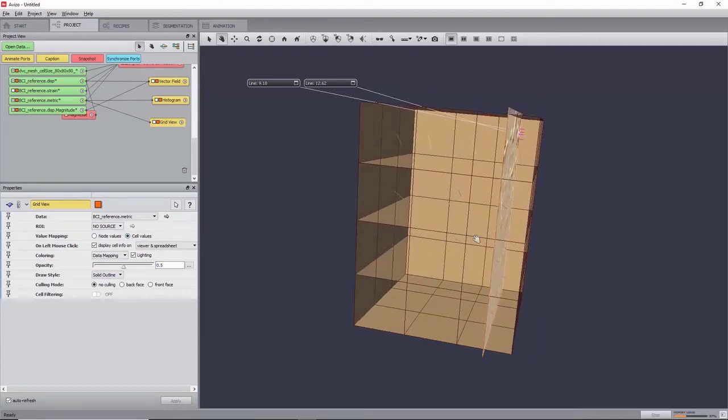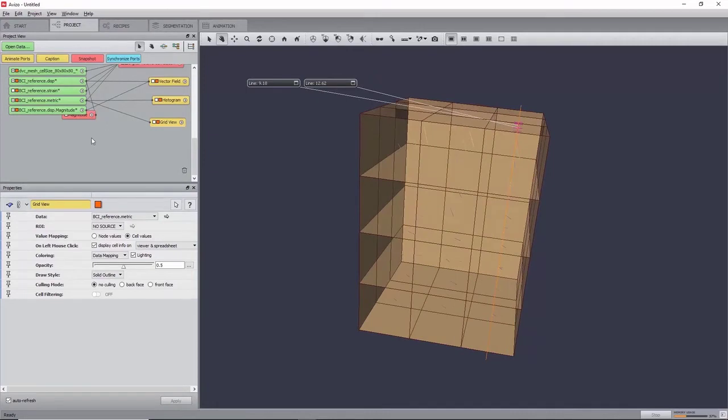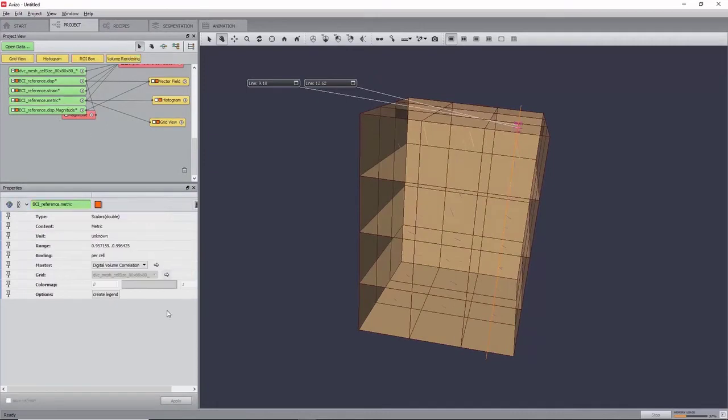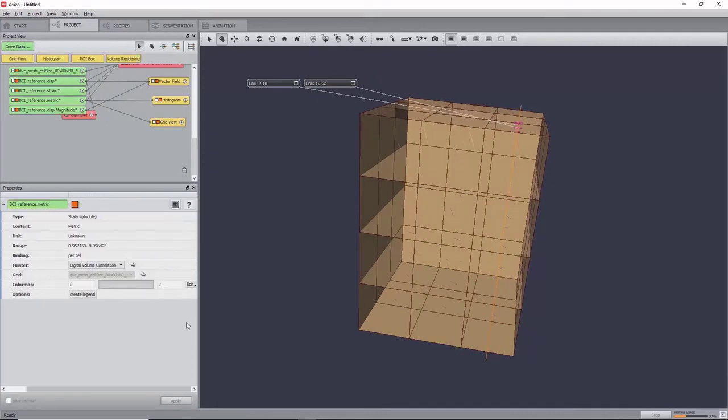For data field resulting from the DVC module, the color map used for visualization is adjusted in the color port of the data field itself. Here, select BCI reference metric.